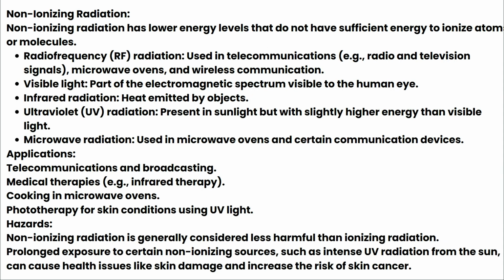Similarly, non-ionizing radiation has low energy levels, and some of the different types are radio frequency, visible light, infrared, UV rays, etc., and also microwave radiation. Along with being sterilization agents, they are also used in telecommunication, broadcasting, cooking in the form of microwave ovens, and phototherapy for skin conditions using UV light, etc.